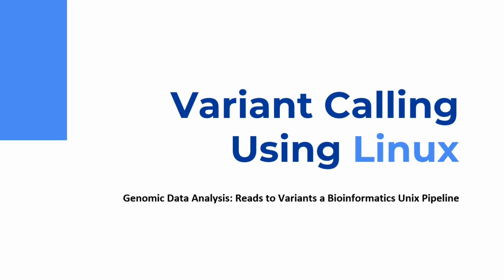So basically, what this heading covers is what variant calling is, what variants are, how to deal with variants, what a bioinformatics pipeline is, and what this course is mainly about. If you're familiar with NGS data, you know that next generation sequencing produces a lot of files, and by using those files we can analyze genomic variants, like how the changes that were defined in the previous era are now defined in the reference genome.